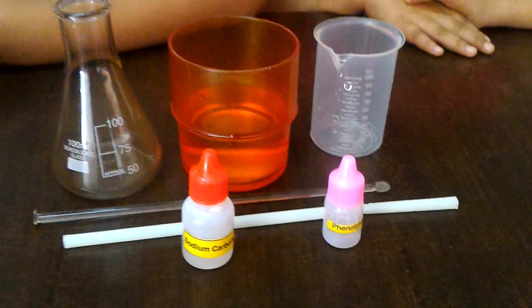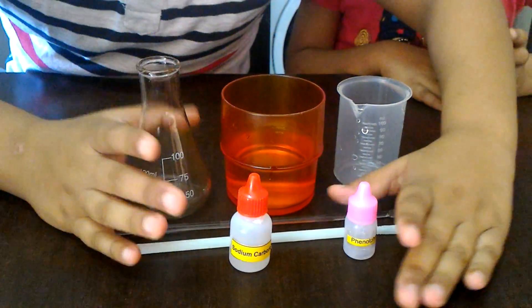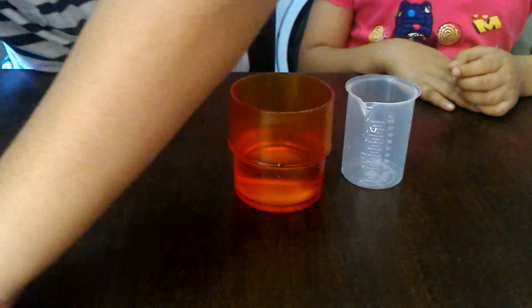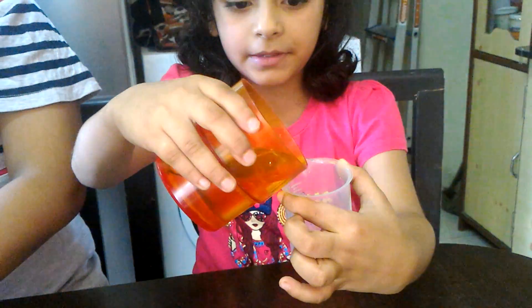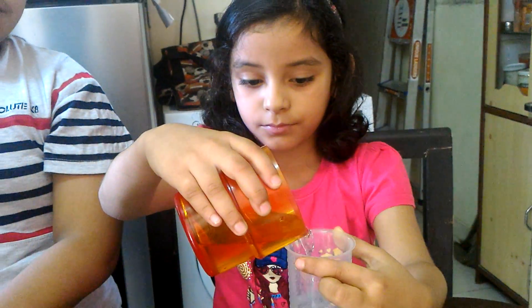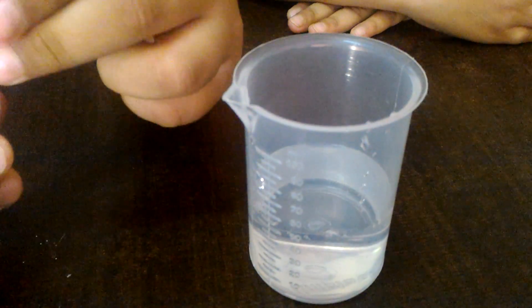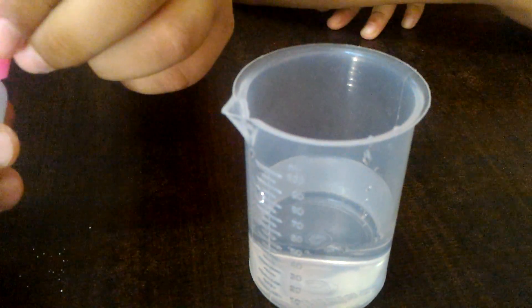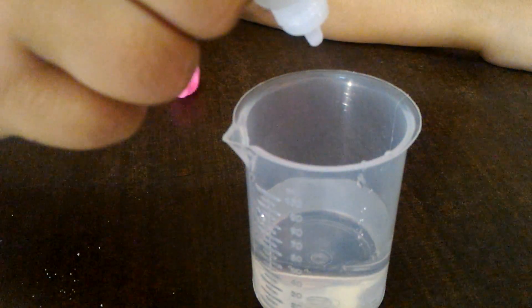We will begin with our experiment — I hope you enjoy it. Step one: we will pour 50 ml of water in the beaker. And then step two: we will put around two drops of phenolphthalein acid-base indicator.